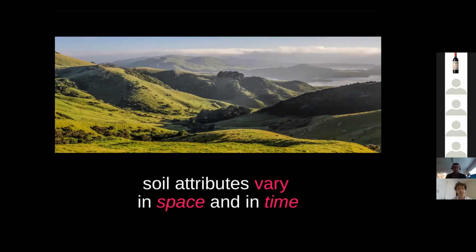It's a challenge because they're expensive and they take time. They're expensive because, well, you've got to get out there, you've got to dig a hole, grab a sample, and then you've got to typically bring those samples back to the lab and do some form of wet chemistry on them. And the lab might have a backlog of samples. So not only are those samples expensive to process, they can also take a little bit too much time to someone's liking when they're, for example, mapping soil for a farmer. As a result, often you are limited by your budget in terms of how many points you can run through a landscape to try to understand how that landscape works.